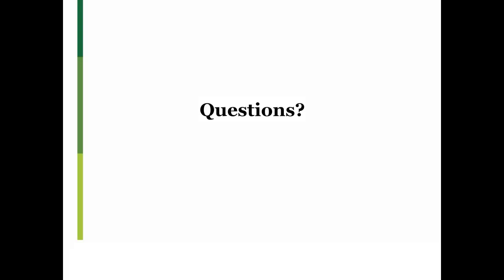Our first question is, would the use of flow cytometry in conjunction with single-cell dissociation make primary tumor identification easier? I think it has the potential. I think it would depend on having good markers for immunophenotyping for the particular type of primary sample that you're trying to identify.